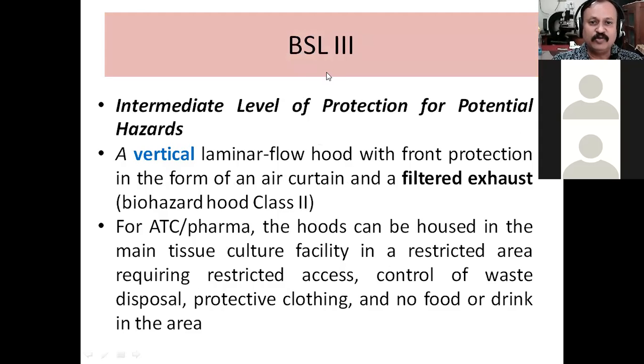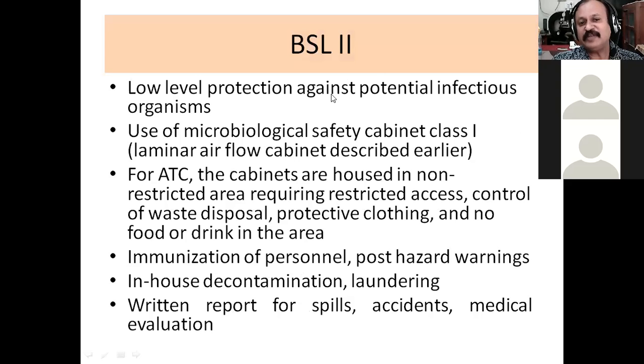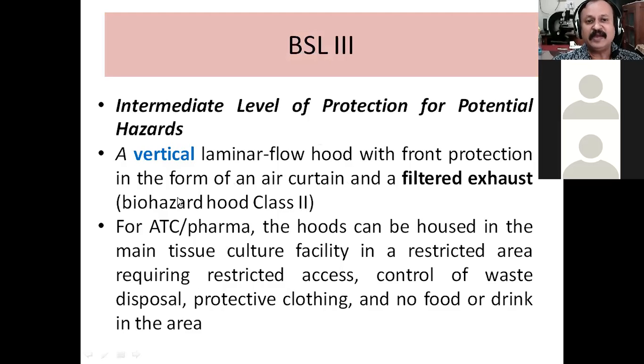Then we go to biosafety level 3. What we have seen is that in biosafety level 2, we have some restriction and some kind of control is necessary, and we use the laminar airflow cabinet class 1. But when we go to biosafety level 3, some more protection is required. We are not going to use the normal laminar airflow cabinet class 1, but the class 2 cabinet. A class 2 biohazard hood or class 2 biosafety cabinet is what we use here.